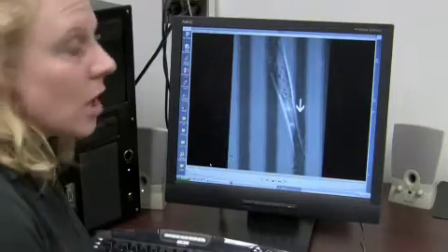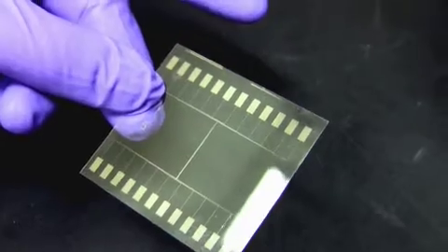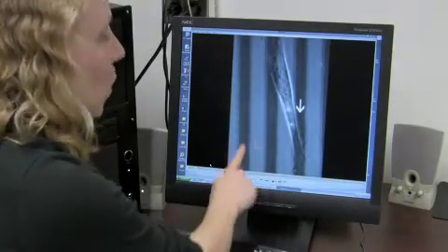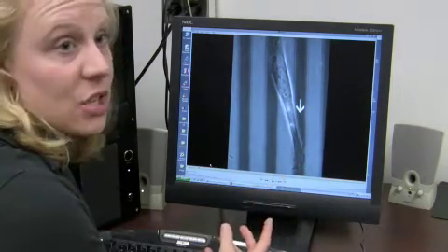This is a microscope image of a cell — this is the cell on an electrode, on my release electrode. This is glass and this is gold, and there are special molecules on the gold that the cell likes to attach to.